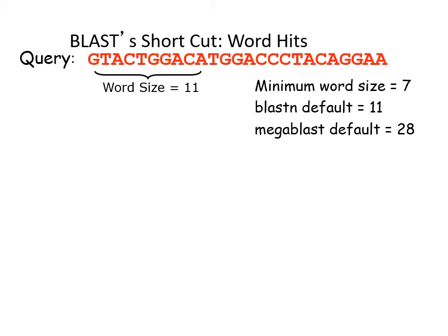So this is kind of how it works. It's going to take your unknown sequence, and it's going to break it into words. Now, this is a bit dated, and they've changed the program, but the idea is the same. They're going to break your sequence into 11-letter words.